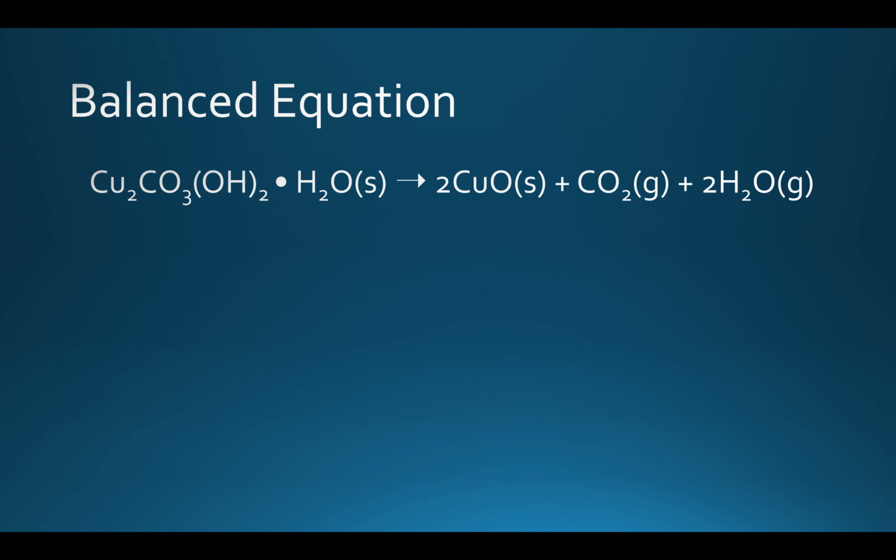Here you see our balanced equation for this reaction. You can note that the H2O and the carbonate in the original reactant turned into water vapor and CO2 gas so that it is no longer a part of the copper 2 oxide.